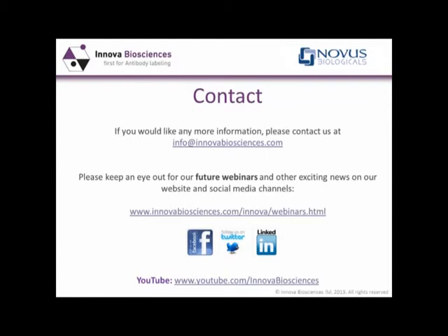So the first question is, how much substrate should I have in my assay? The ideal situation is that you're going to hydrolyze 5 to 10% of your substrate. So to get a good signal, you're probably going to need somewhere between 0.25 and 1 millimolar substrate. That will generate enough phosphate to get a reasonable signal in your assay.